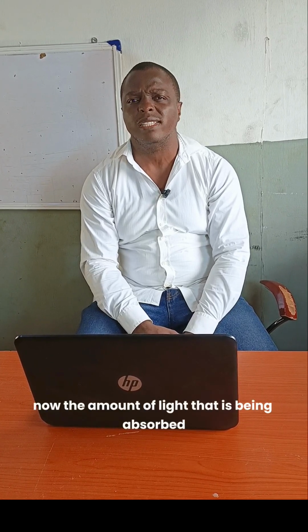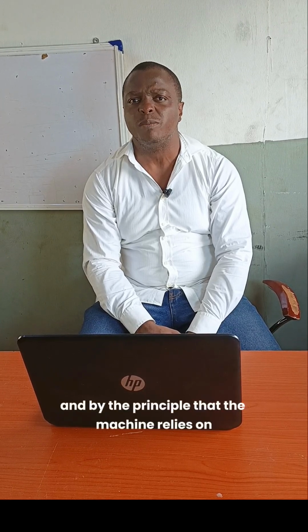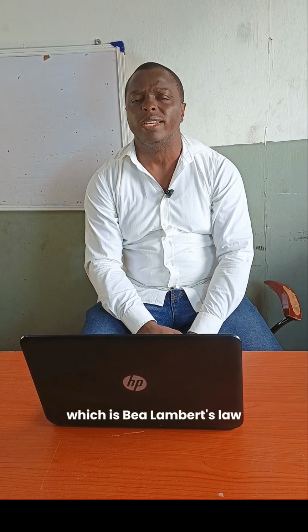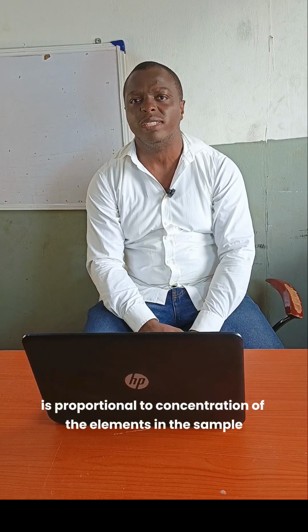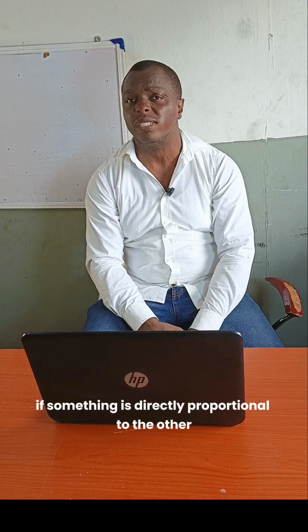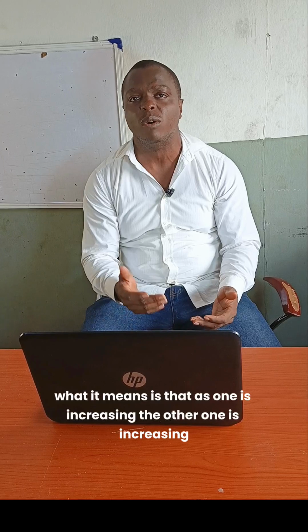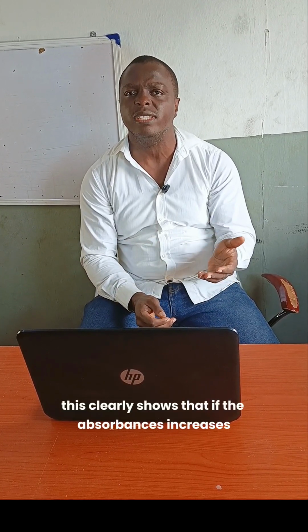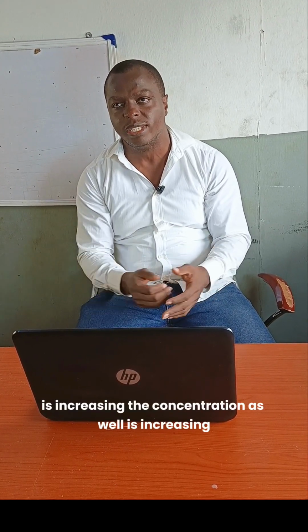Now, the amount of light that is absorbed is measured by the instrument, and the principle that the technique relies on is Beer-Lambert's law. The amount of light that is absorbed is proportional to the concentration of the element in the sample. Now, what does this imply? If something is directly proportional to the other, it means that as one is increasing, the other is increasing. This clearly shows that if the absorbance is increasing, the concentration as well is increasing.